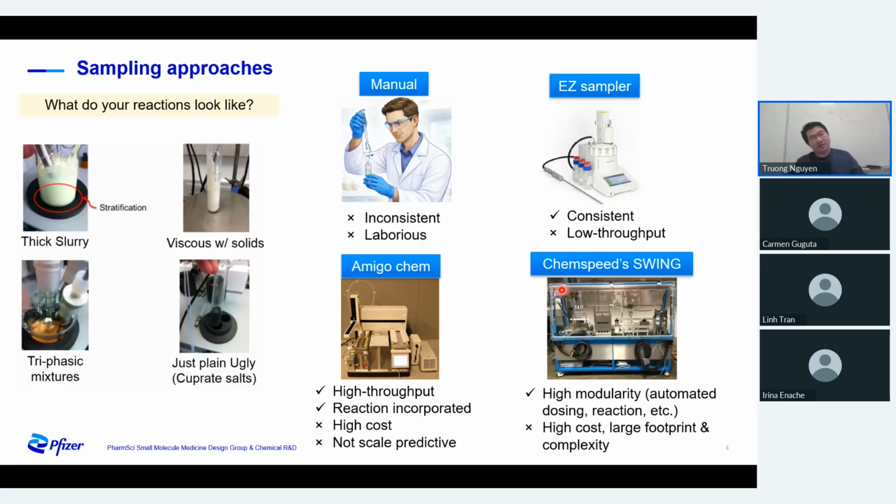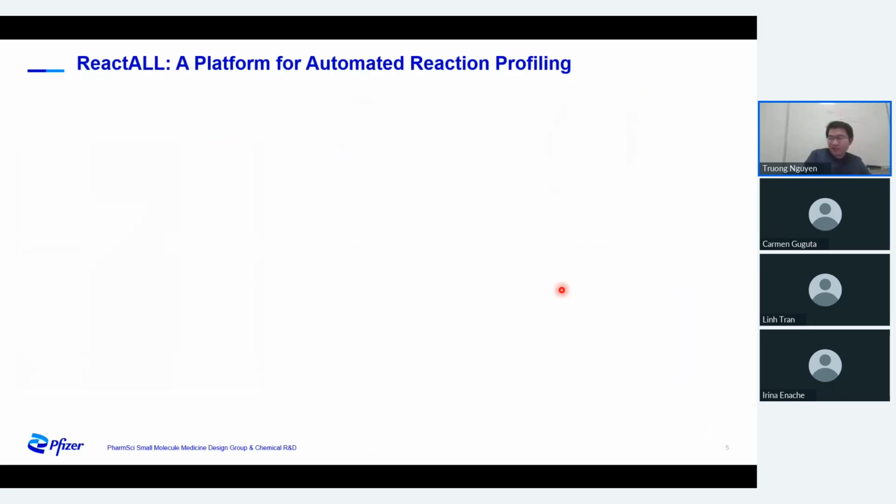Because of that, the reactors were developed. It was initially co-developed between Technovus and some pharmaceutical companies.